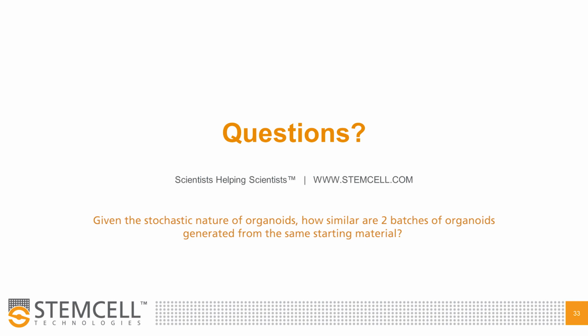Yeah, that is a good question, and we do see variability in the gene expression profile between different cultures. We usually set up a couple of repeats to ensure that there is a robust readout at the end of the differentiation. But you're right in that the organoids that do emerge are not homogeneous in their subpopulations and hence not in their gene expression either.